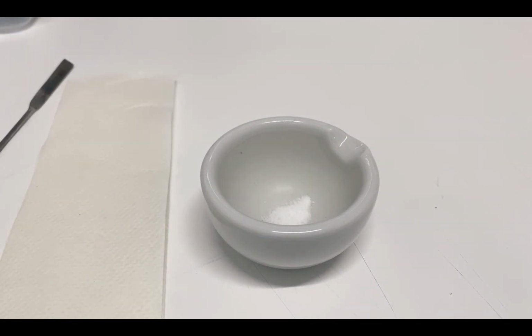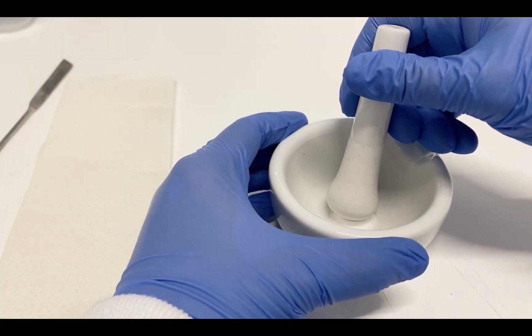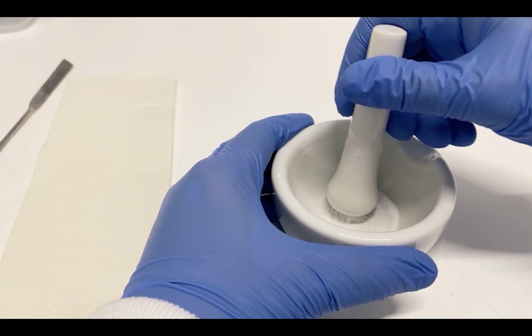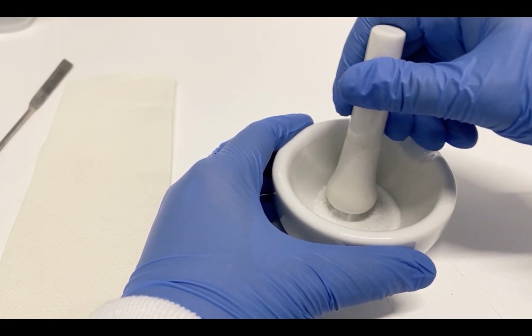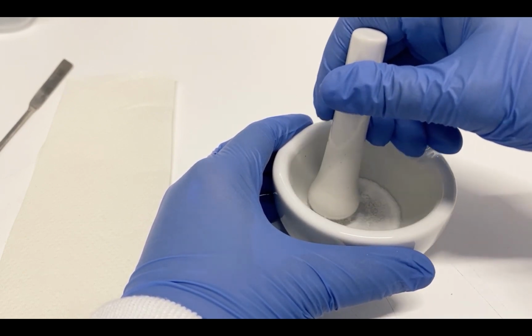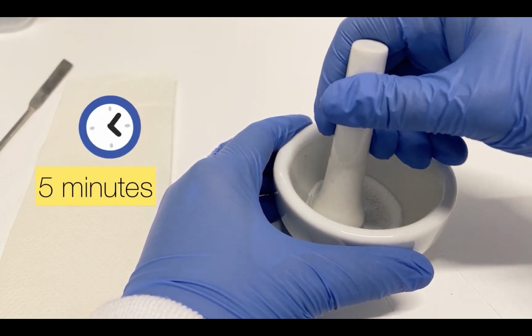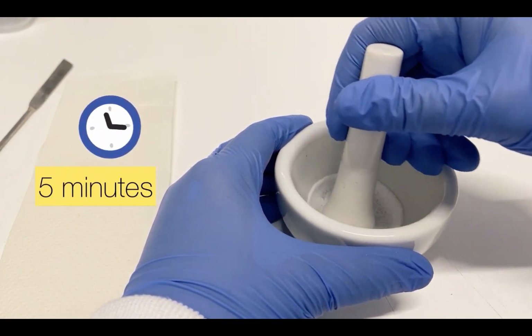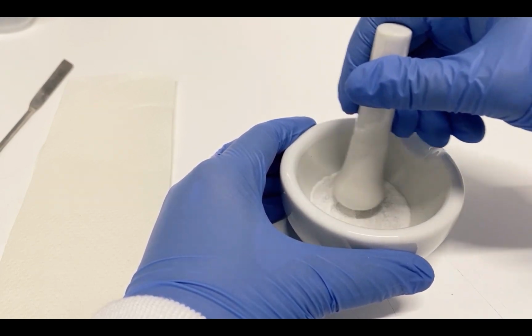Using the pestle, fully triturate or finely grind the solid mixture. Hold the pestle firmly in your hand and rotate around against the side and bottom of the mortar. Use your other hand to grasp the mortar to hold it in place. Do this for a period of 5 minutes to promote uniform distribution and achieve better homogeneity.